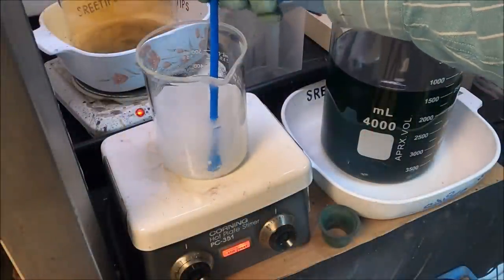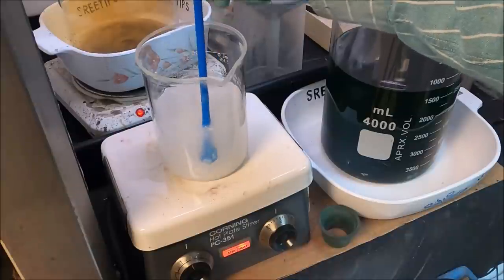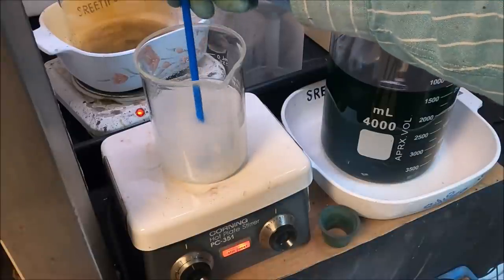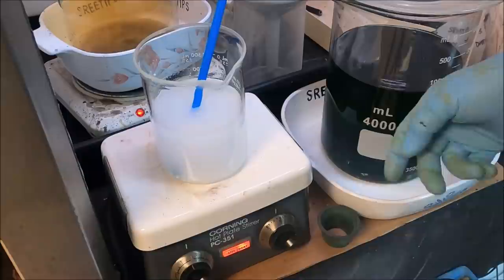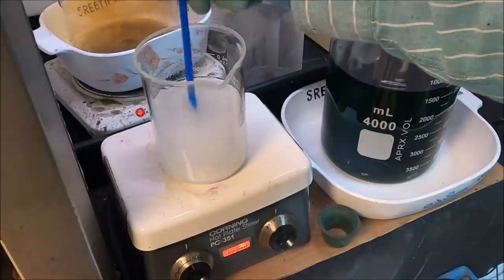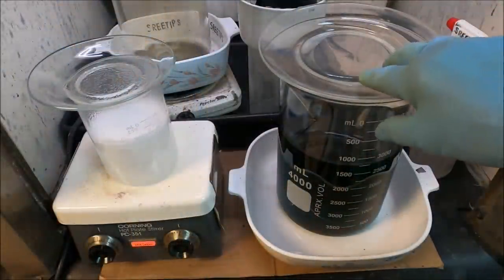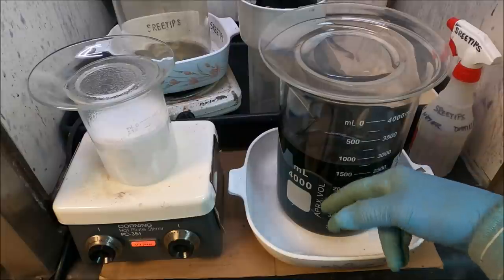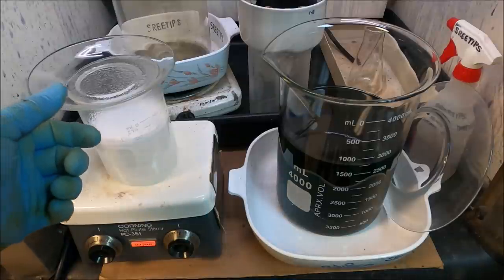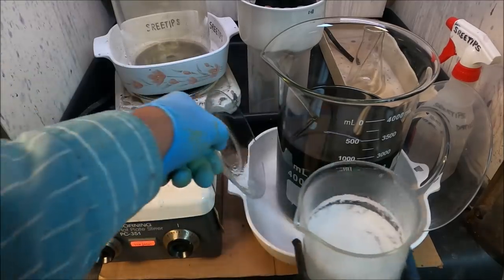All right, I've got the dimethylglyoxime in here. It does not dissolve very well in water. But I'm going to try to get enough of it to go into solution, and then we'll add it to our beaker here, precipitate out the platinum group metals with it. Trying to smash up some of these big hunks so we don't get big chunks of it floating around in our solution. All right, here we go. We've got our silver, platinum group metals, and gold in this beaker. And what I'm going to do now is pour in some dimethylglyoxime that I've had dissolving here in hot water.